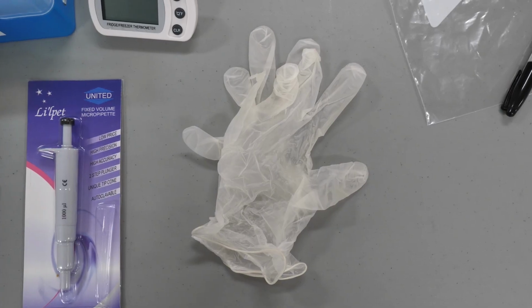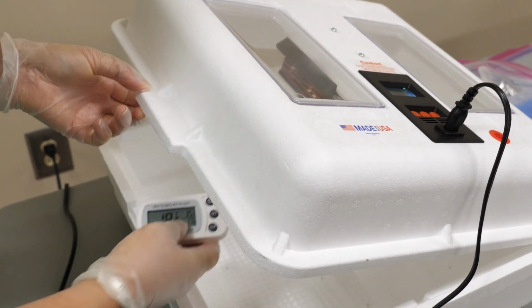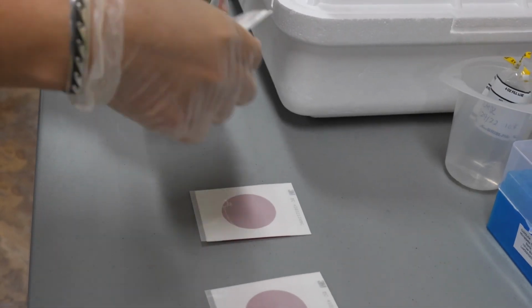Wear gloves throughout the entire process of plating and incubating your stream sample, and make sure your space is clean and dry. Place the max min thermometer inside of the incubator. Remove the frozen 3M Petrofilm plates from the freezer.